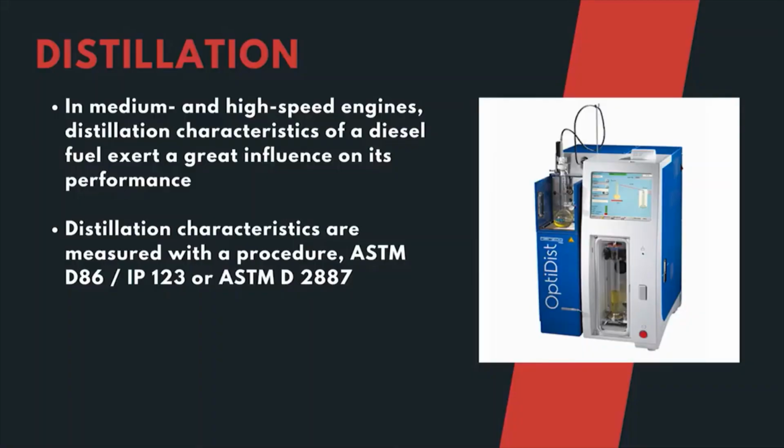Then distillation is an important test that is performed for crude or gasoline or some other petroleum products. In medium and high speed engines, distillation characteristics of a diesel fuel exert a great influence on its performance. Distillation characteristics are measured with the procedure ASTM D86.